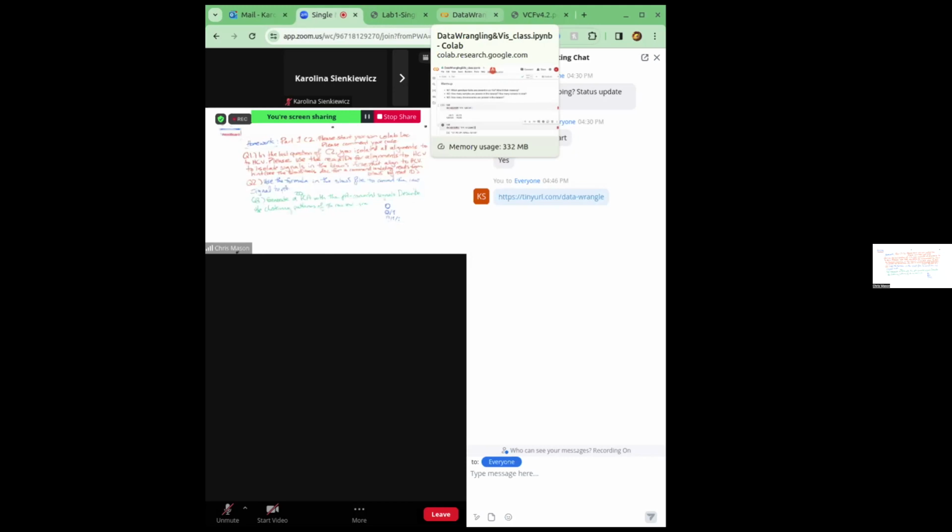The unphased genotype is separated by a slash. The difference between this one and this one is that this is the phased genotype. The 0 here is the reference, and 1 is alternative allele number 1. If we have more than one after commas in the alt field, then there's going to be alternative allele number 2. And if you look at the AD field, this is the allelic depth. You also have the same number of alternative alleles there, comma delimited.